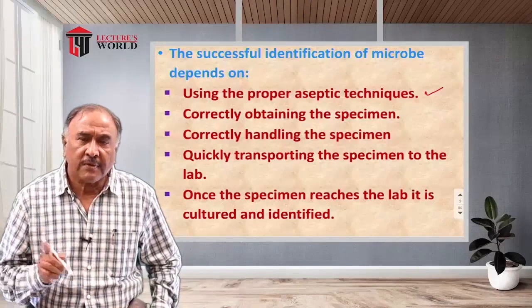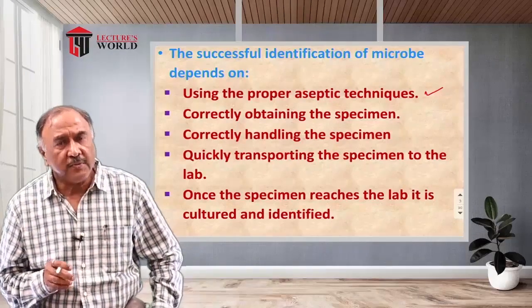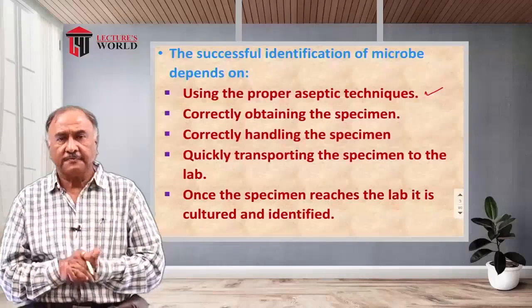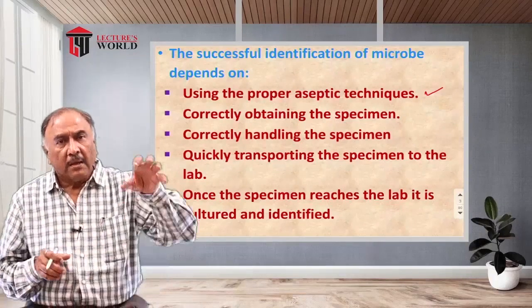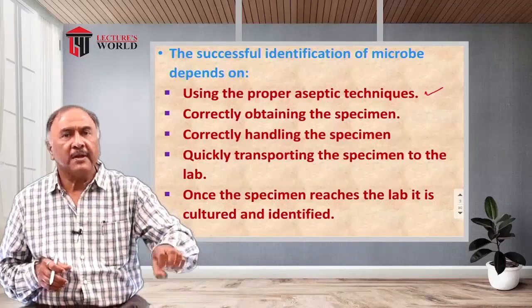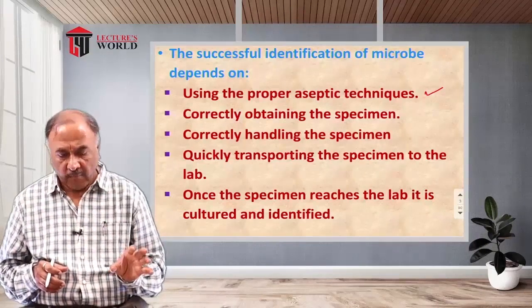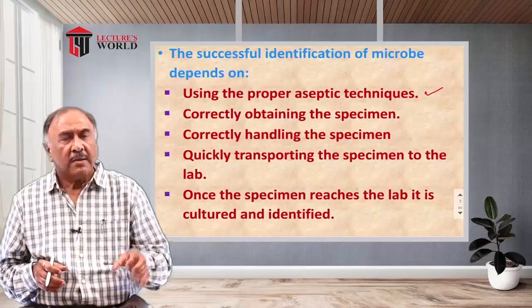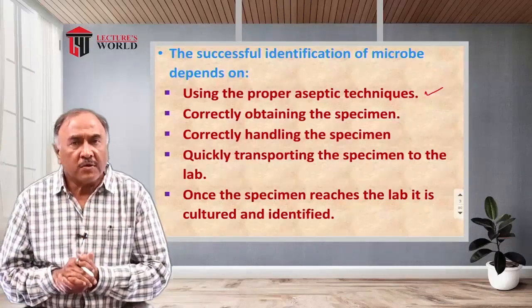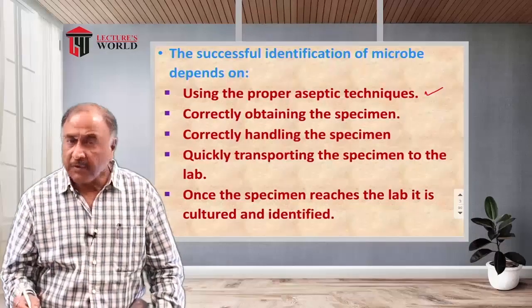So first is the aseptic technique, and it has to be used at each and every stage of these methods. It should be used where the sample is being collected from the patient and sent to the laboratory, as well as in the methods being used in the laboratory, which should also follow aseptic procedures. So that was the first point.